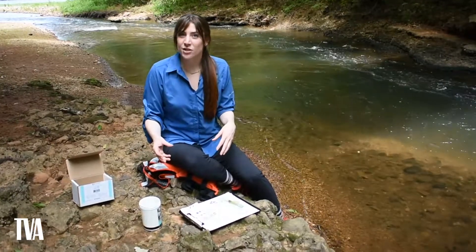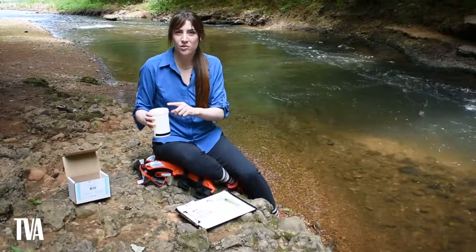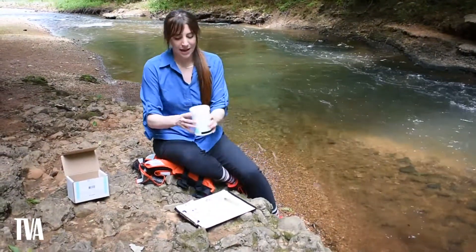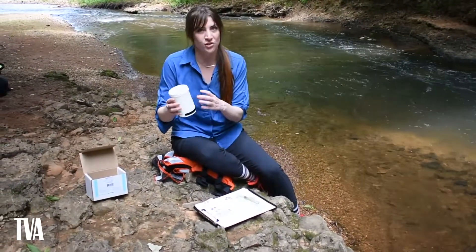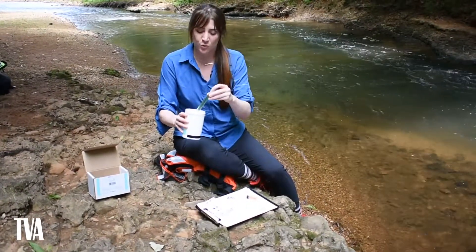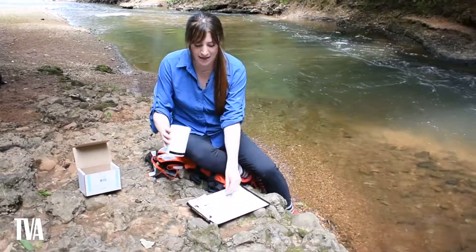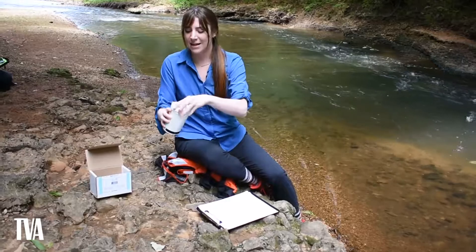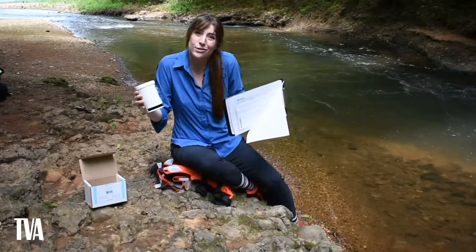Now that the experiment is finished, the last thing to do is clean up. Since this is just pond, creek, or stream water, you can pour it right back where you found it. Make sure you return everything to the visitor station, ranger station, or wherever you checked it out from. Don't worry about disposing of the chemicals — a ranger will do that for you. Put everything, including your trash, back into the beaker. Once the lid is on, return it along with your data sheet, and hopefully you'll get a little prize.